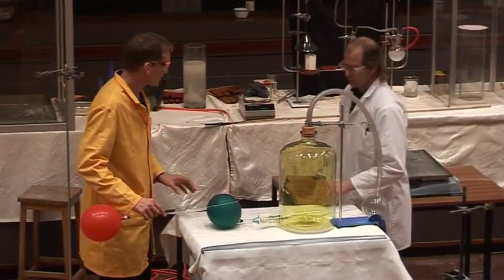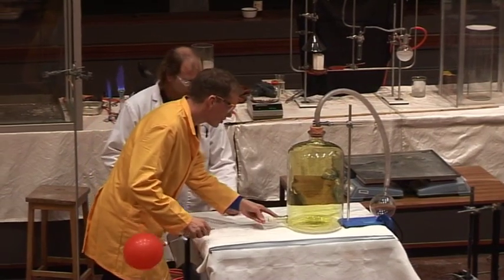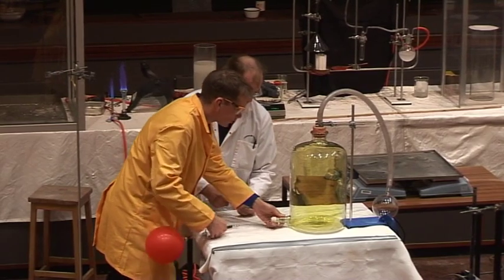So this balloon has the acetylene in. And this balloon has the hydrogen. So I'm going to put the hydrogen balloon into the chlorine.